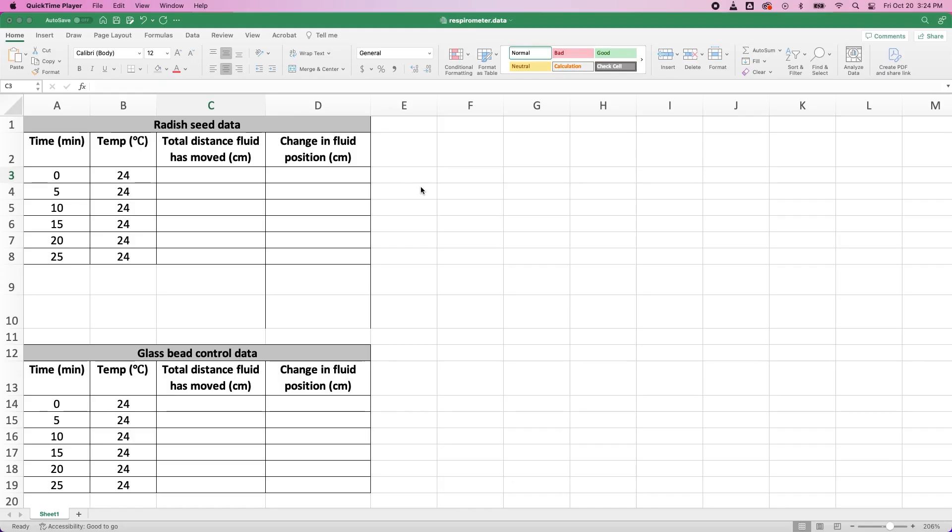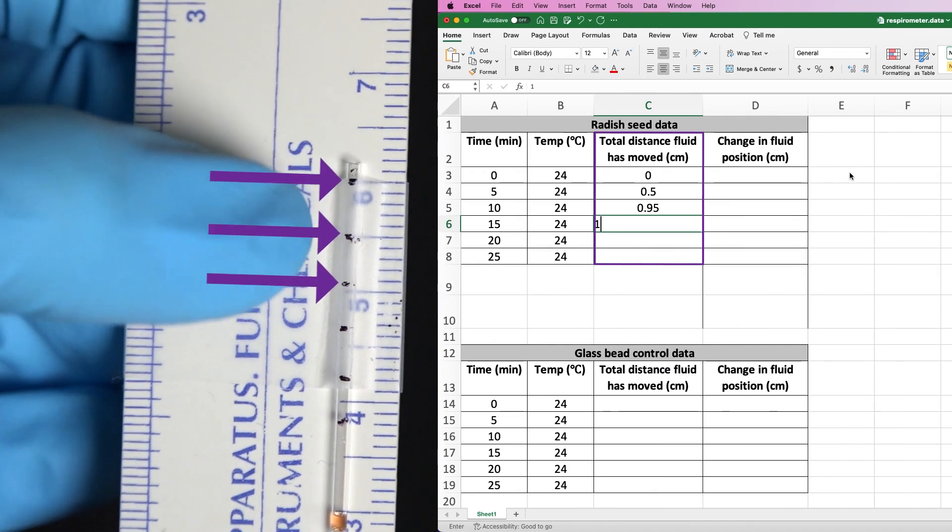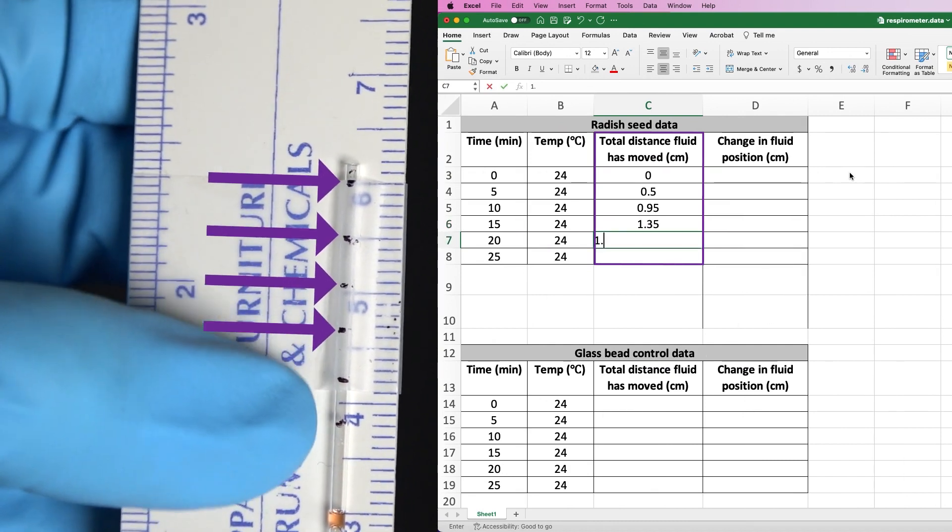Once the experiment is complete, I'll enter my measurements into data tables, one for each syringe. In the first column are my time points starting at 0 minutes, my initial measurement, and going in increments of 5 up to 25 minutes. My temperature readings go into the second column, and then the actual measurement of how much the fluid moved in the capillary tube will go in the third column. I'll use my ruler to find the length of my markings from the starting point at time zero.